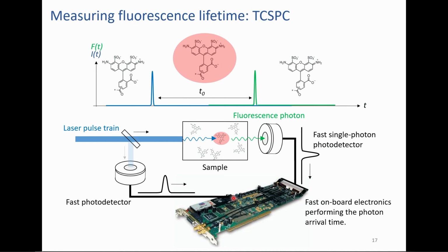Essentially, that's just a voltage integrator. The voltage integrator charges up a capacitor, and then once the signal photon arrives, which you measure with another detector here, you stop charging the capacitor and you read off the voltage. What this is called is a time to amplitude converter. Once that's done, the voltage is essentially plotted as part of this histogram, converted to what the arrival time was.